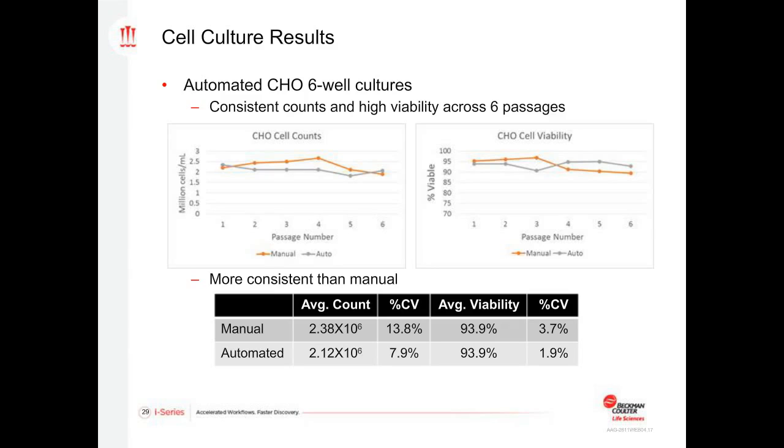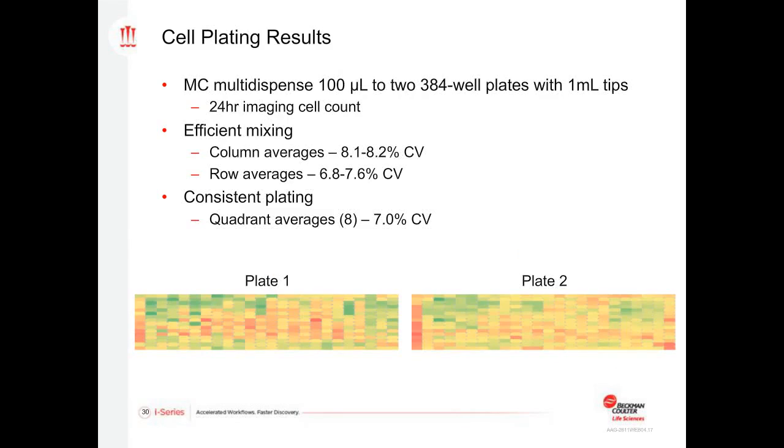When it comes to actually plating, the video demonstrated plating into 4 96 well plates, but we decided to take it one step further and try to plate into 2 384 well plates, doing 100 microliter multi-dispenses, much like we demonstrated in the video. So again, 100 microliters per well times 768 wells. And we did imaging after 24 hours.